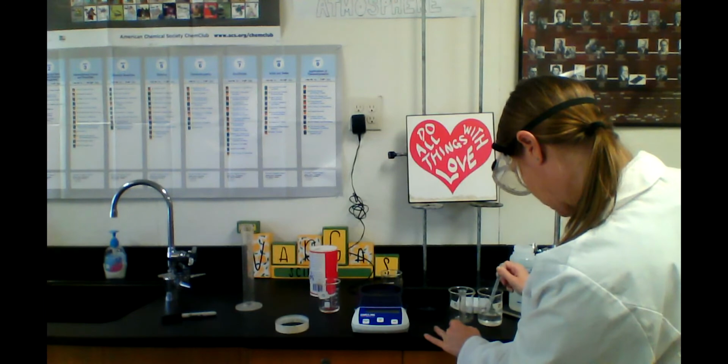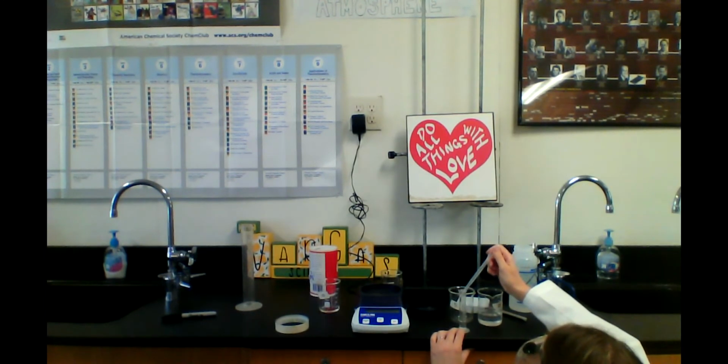And for our 5% sodium chloride, we only need 4 milliliters. So I'm just going to use my plastic pipette to add 4 milliliters here. There we go. Okay.